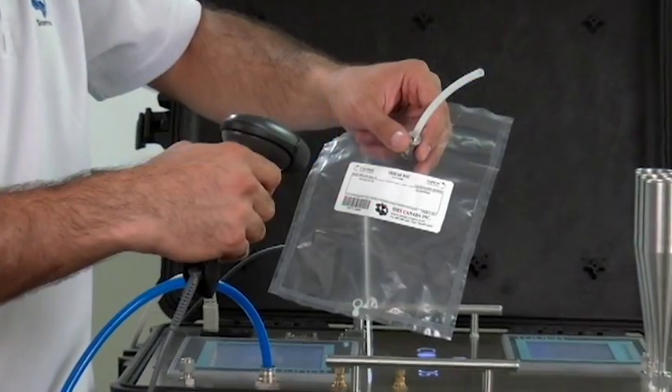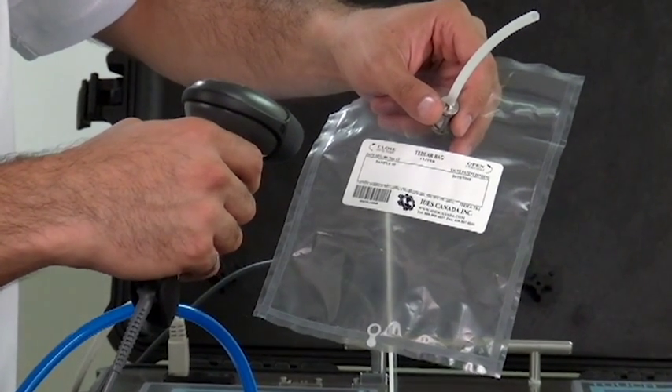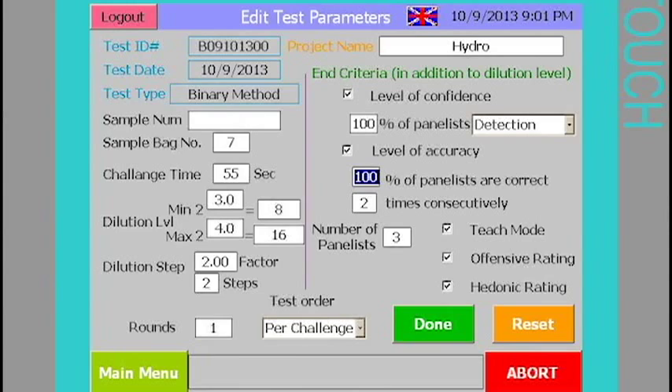The SC300 can be connected to a barcode scanner and used with your laboratory information management system to keep track of the samples being analyzed. This will significantly reduce the chances of human error in entering the sample ID.